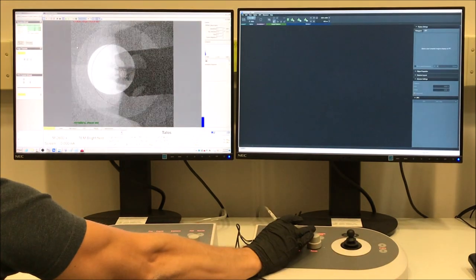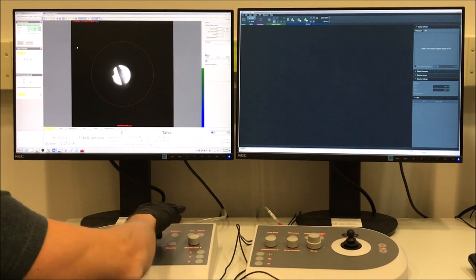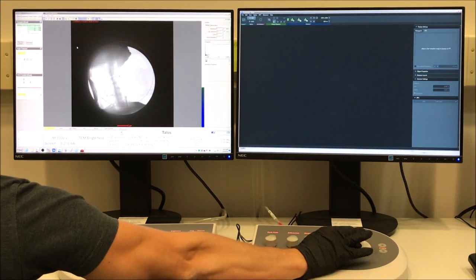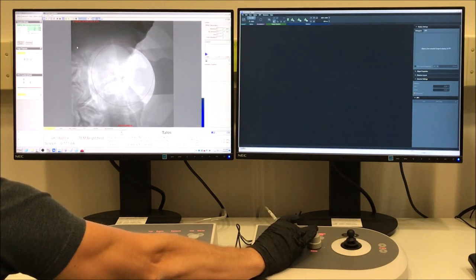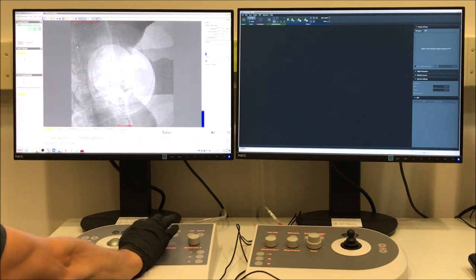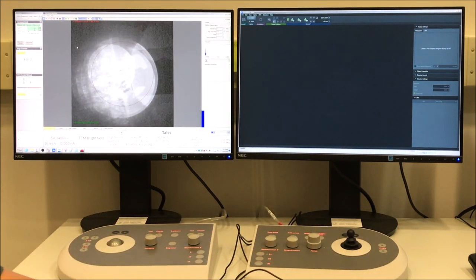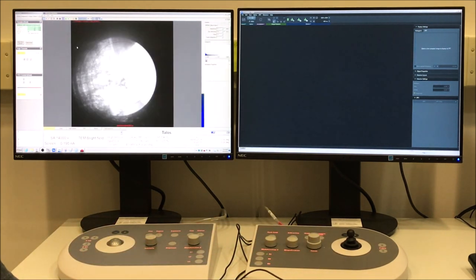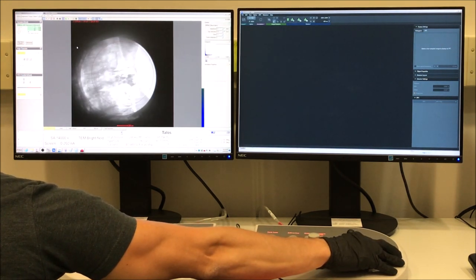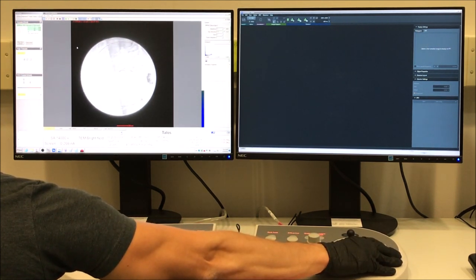And we switched from LM into M mode. Then I'll just use the joystick here to recenter the lamella. Then we'll go into SA mode, and now we can set eucentric height. So this is just like described previously. Press eucentric focus while in SA mode, and then use your Z-axis buttons. Again, these are both on the right hand panel to minimize contrast of the image. I apologize, the contrast in the video is a little extreme at the moment.